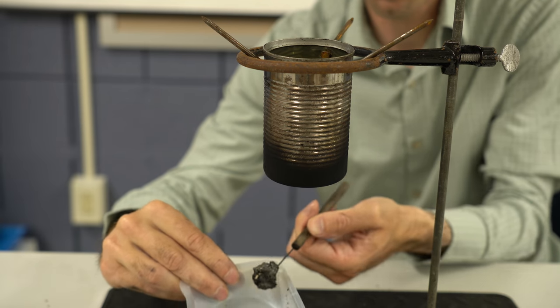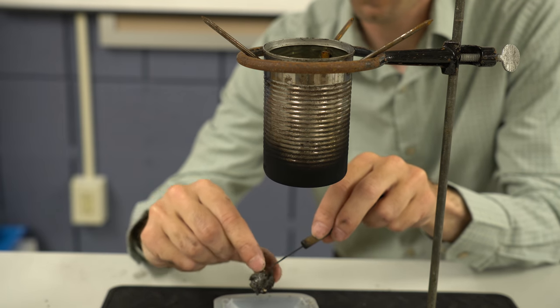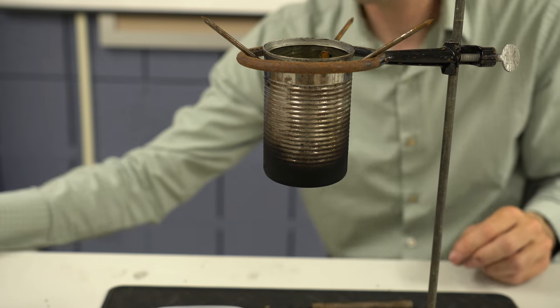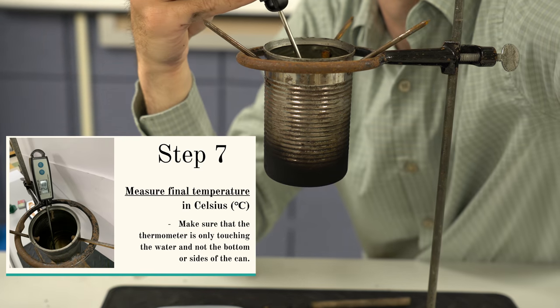Be careful, that metal part of the skewer is going to be quite hot. Kick that off. Okay, it gets a little sticky on the inside. So I'll get that off there. Then before we weigh that, we want to make sure we're getting the temperature of our water relatively quickly. So we go through and now we're going to assess the temperature of the water.